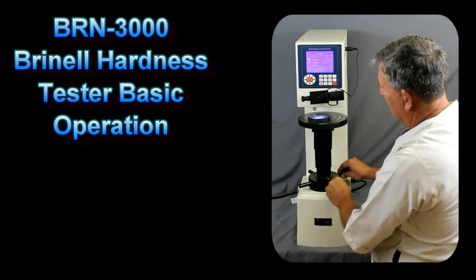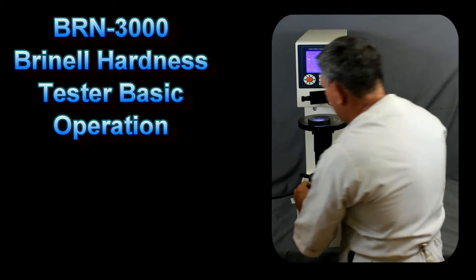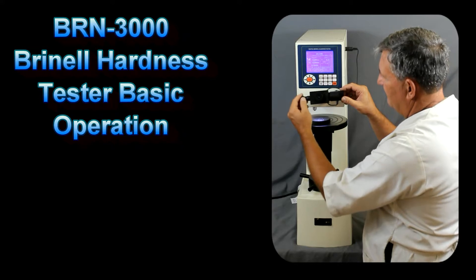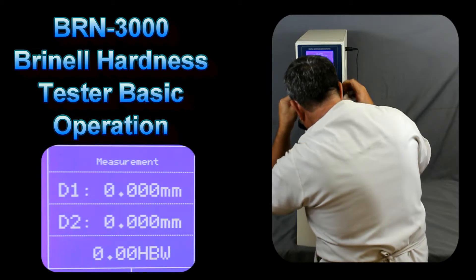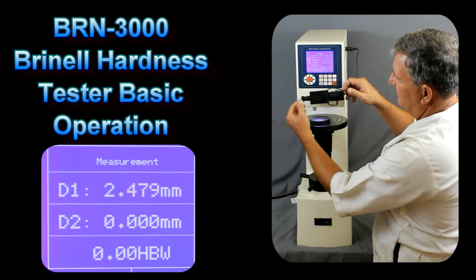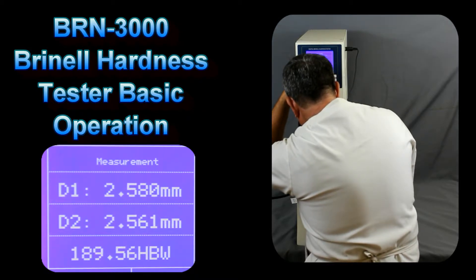Now we want to raise or lower the table so that the indent is in focus. Once it's in focus, we use the left filer to find the left edge of the indent, and then we'll use the right filer to move the second filer to the outside of the right part of the indent. We then accept that measurement with the accept button. We also have to measure the diagonal at 90 degrees — rotate the filer, find the corners of the indent again, and press accept.